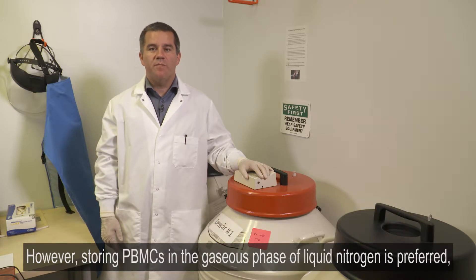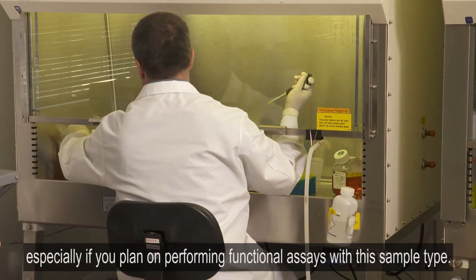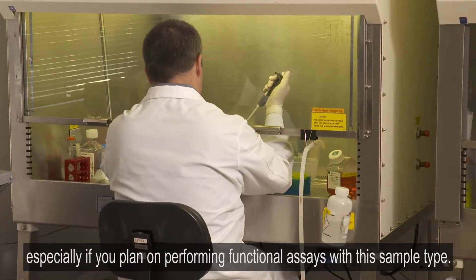However, storing PBMCs in the gaseous phase of liquid nitrogen is preferred, especially if you plan on performing functional assays with this sample type.